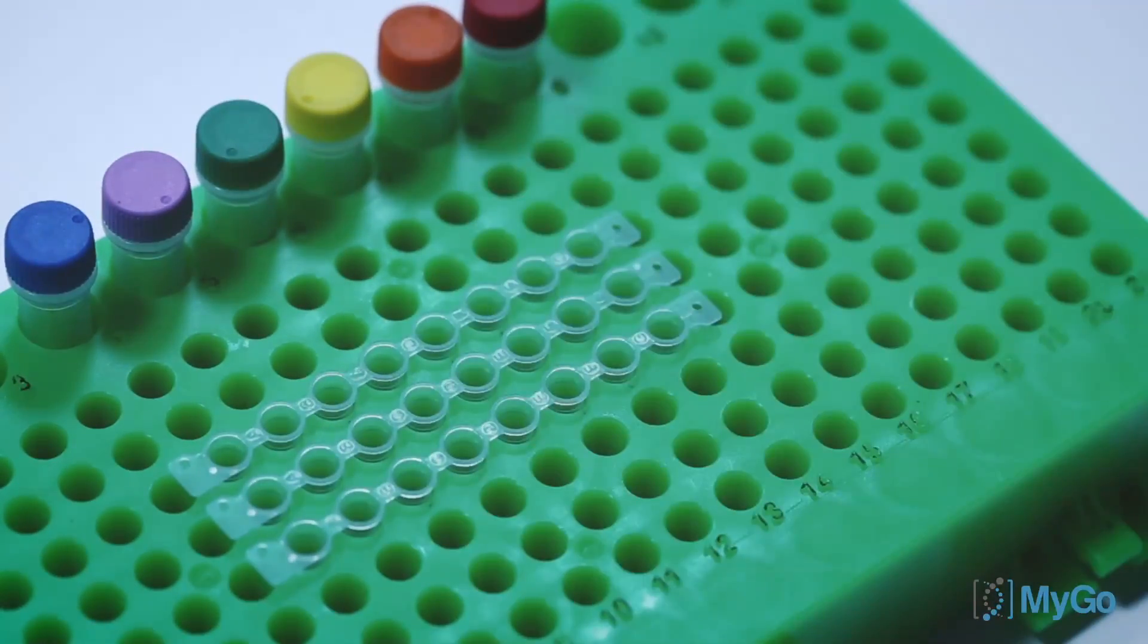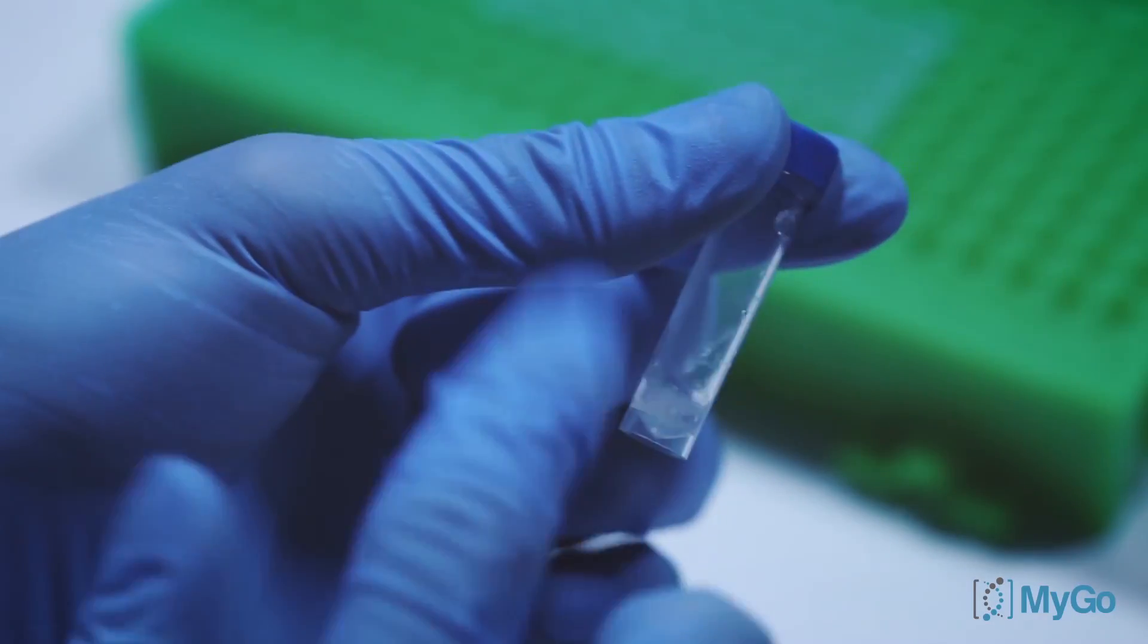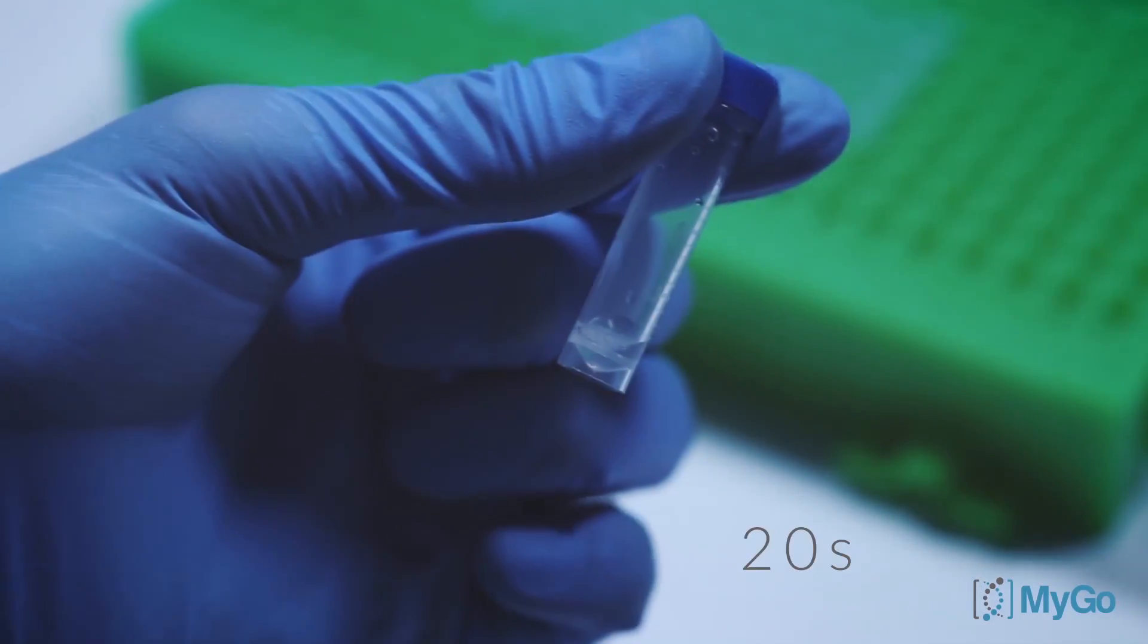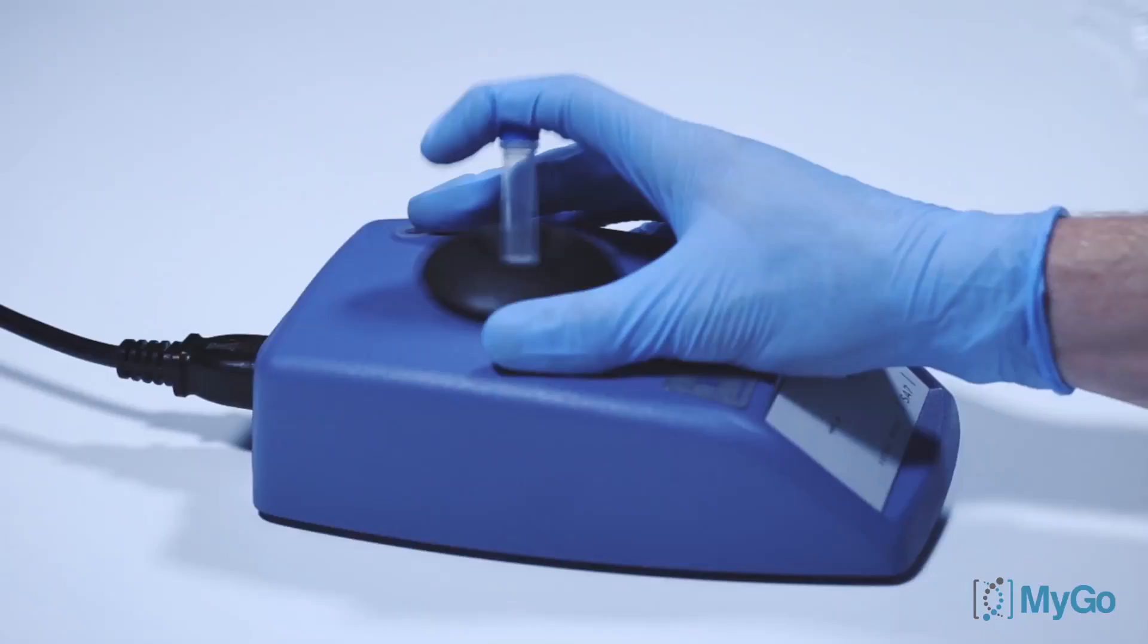Now we'll need to mix the tubes thoroughly. We would recommend mixing the tubes like this for at least 20 seconds, vortexing them and then centrifuging them down. It's important that these tubes are mixed very well after settling.